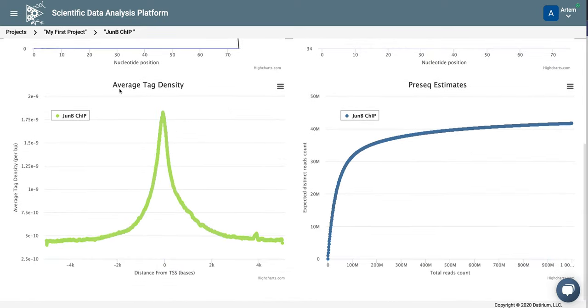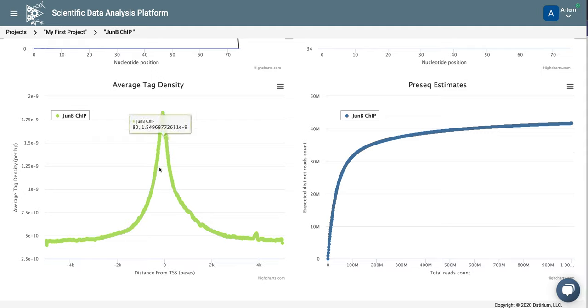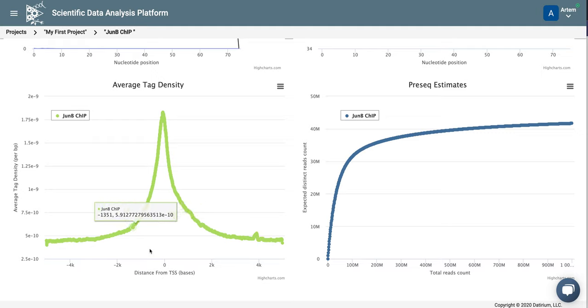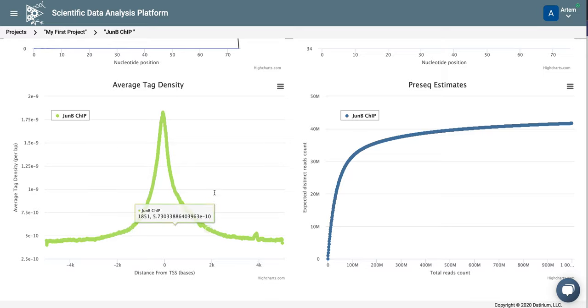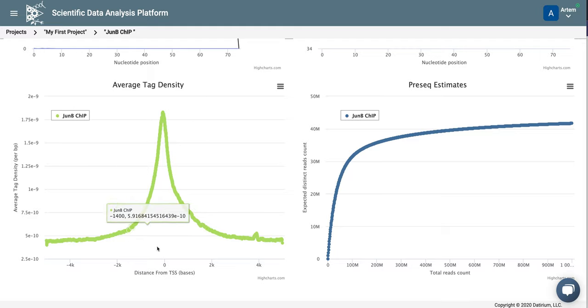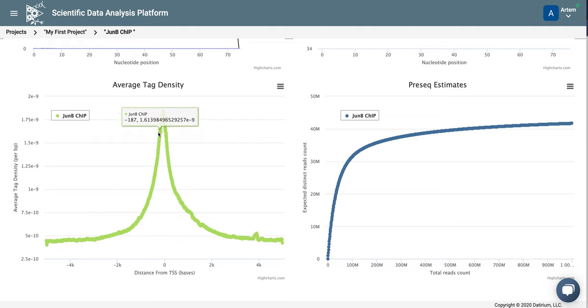Average tag density around the transcription start site of the genes is usually not very useful for transcription factor ChIP-seq. But it is very useful for histone modification ChIP-seq, such as H3K4 trimethylation or H3K27 acetylation or ATAC-seq. But here, nonetheless, we see an enrichment of reads around transcription start site, suggesting that JunB often binds to the promoter of the genes.